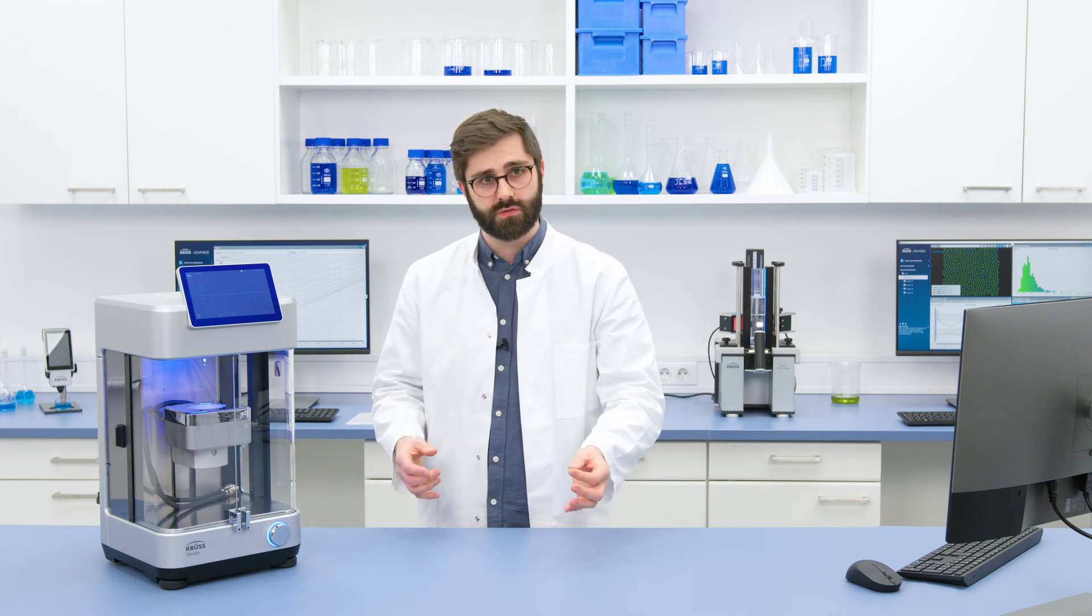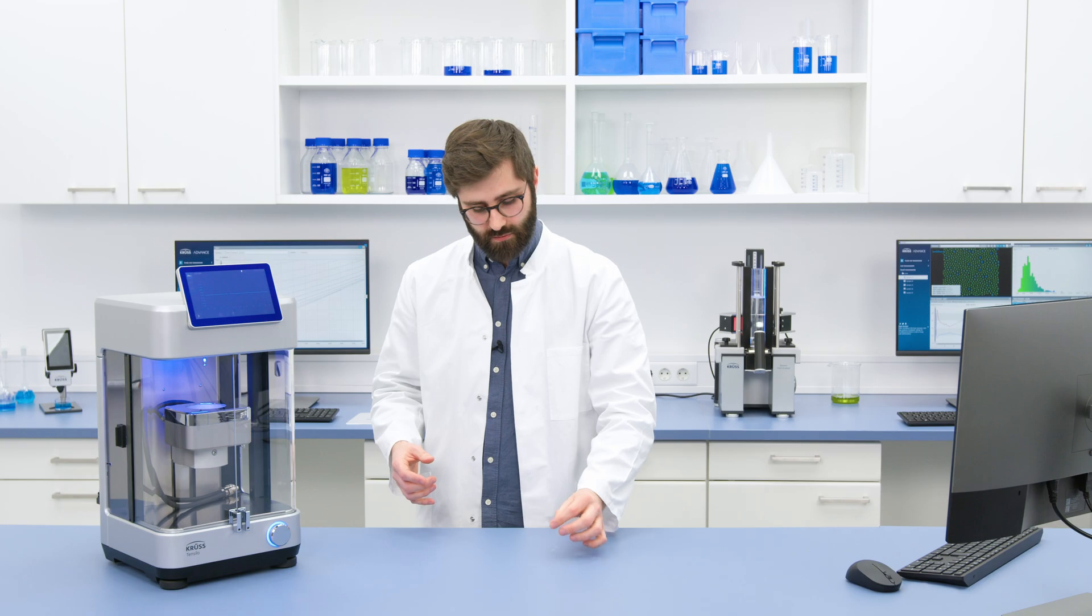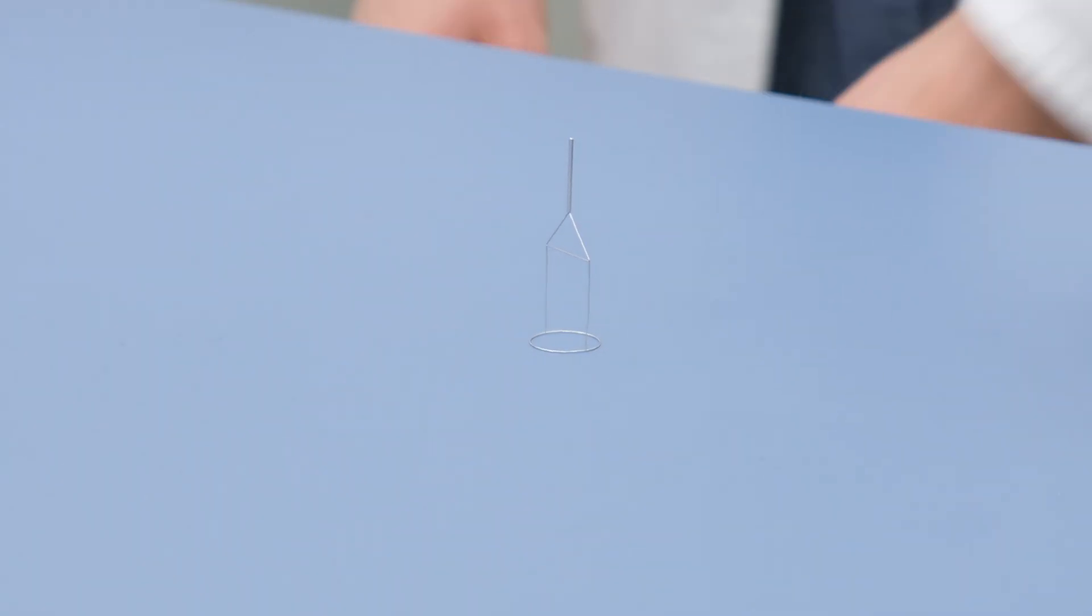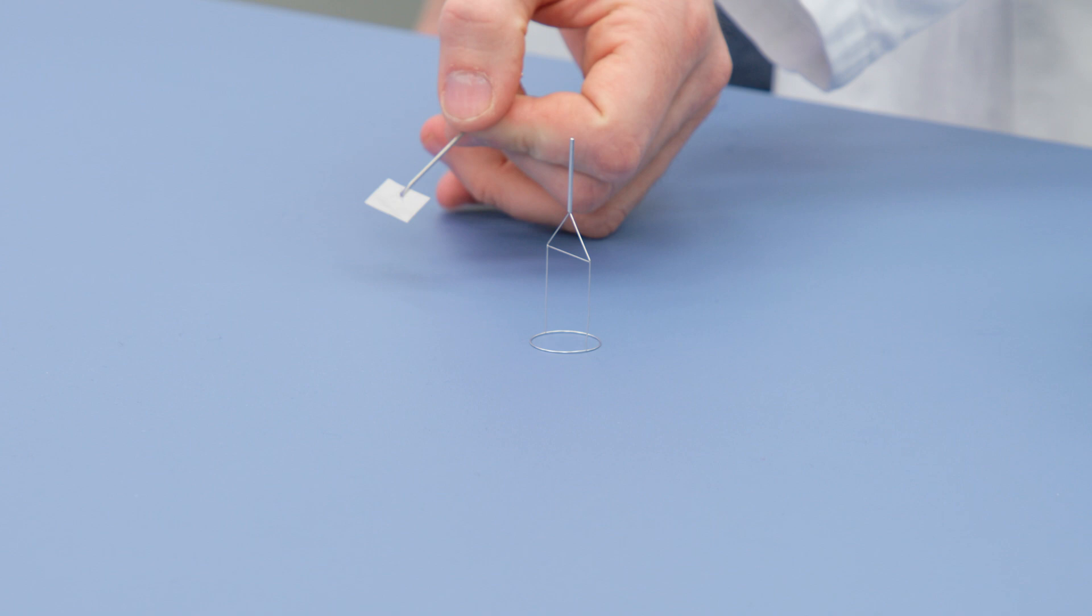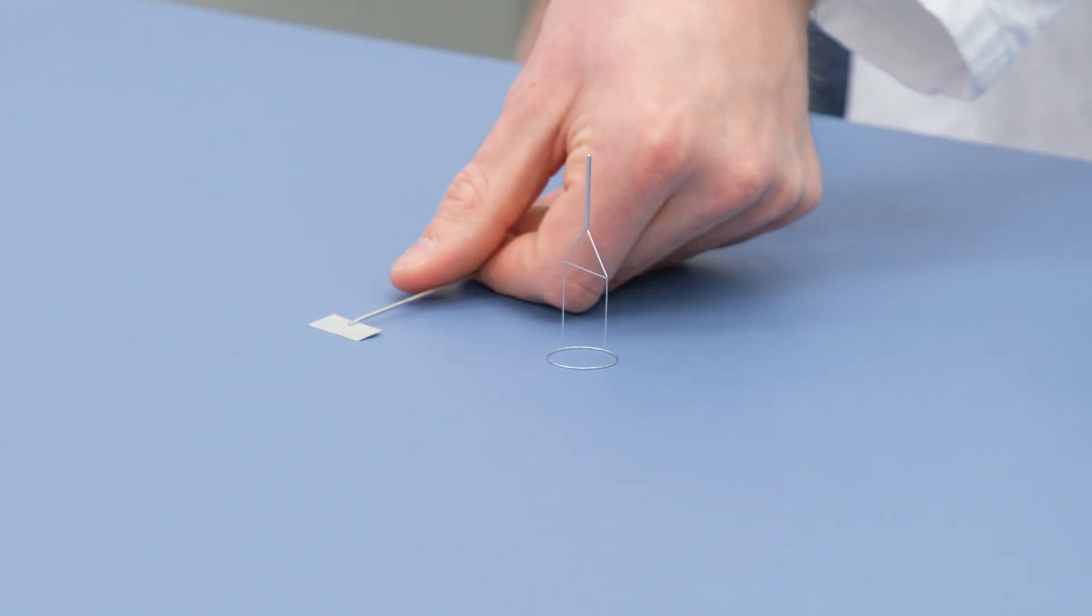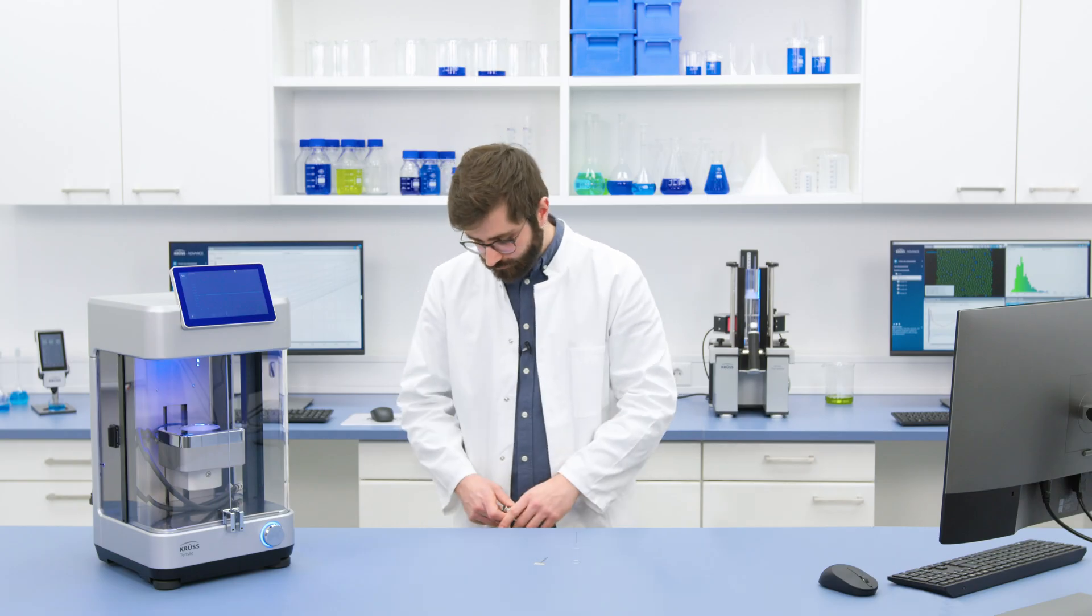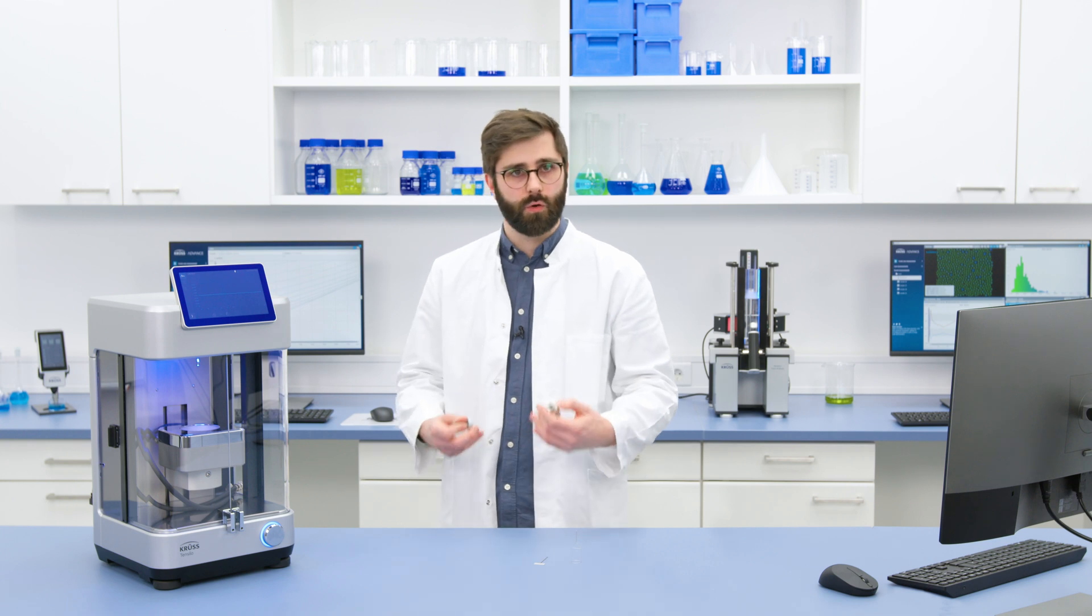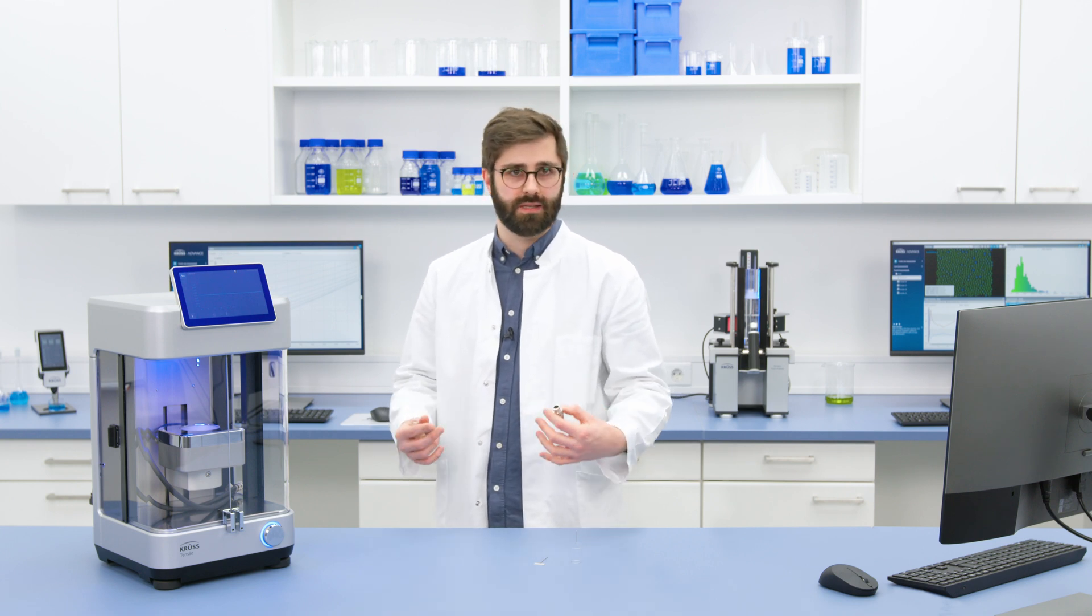This is the typical Denoy ring that will be used for measuring surface tension, or we can switch to the Wilhelmy plate, or I can also use Tensio to characterize not just liquids but solids.